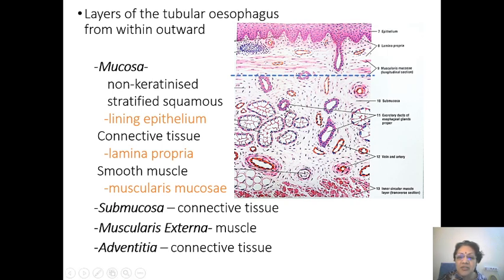And then you have the ducts of the glands, you have the glands themselves, the mucin secreting esophageal glands, you have vessels, you have nerves, all within this connective tissue domain. Then you may have some adipocytes also. The submucosa will have this connective tissue. Then you will see the next layer. Again, the demarcation is somewhat better because muscle stains pink, and you are seeing it in bundles. So muscularis externa is easy to make out where it starts, where it is separated from the submucosa.